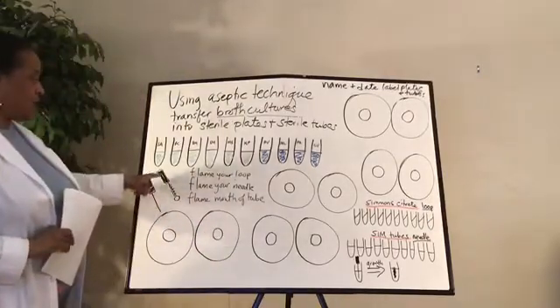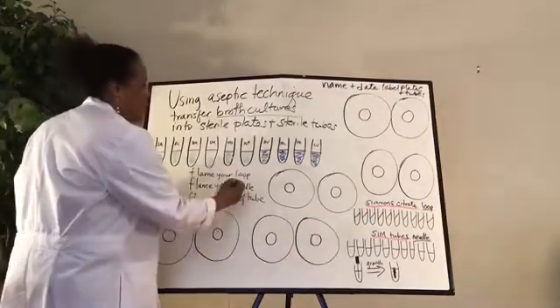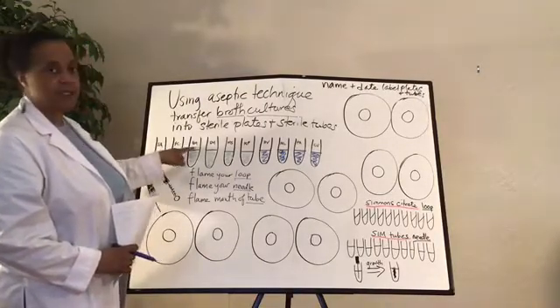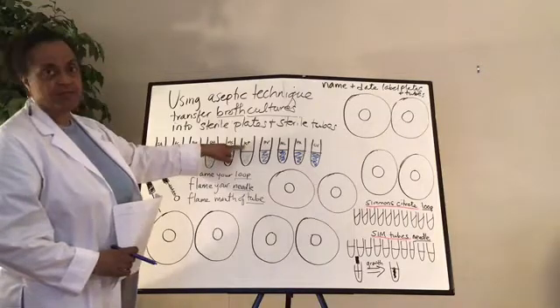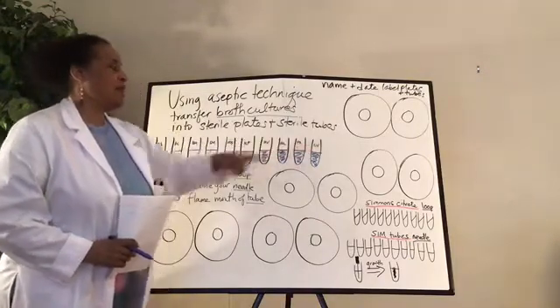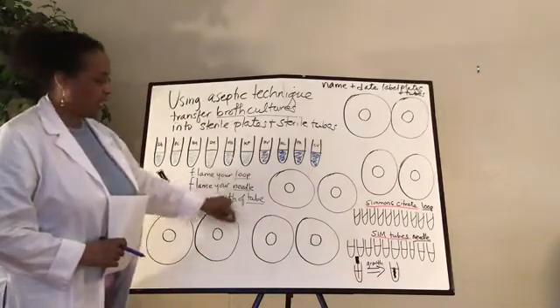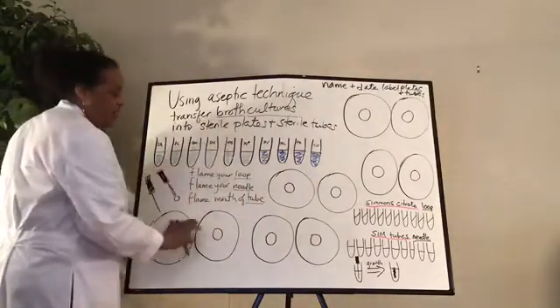Here I've drawn a needle, and here is a loop. Flame your loop, flame your needle, flame the mouth of your tube. You'll remember that as being aseptic technique. Now, if you recall, all of these are different. This is Staph aureus, Escherichia coli, Bacillus megaterium, Serratia marcescens, Mycobacterium smegmatis, Klebsiella pneumoniae, Proteus vulgaris, Micrococcus luteus, Pseudomonas aeruginosa, and Chromobacterium violaceum. And these are all inoculated, been waiting for you to come and get some of it out and start to inoculate your sterile media here.